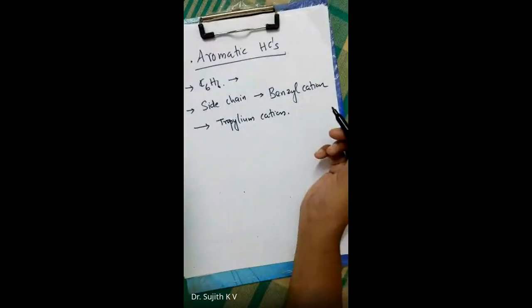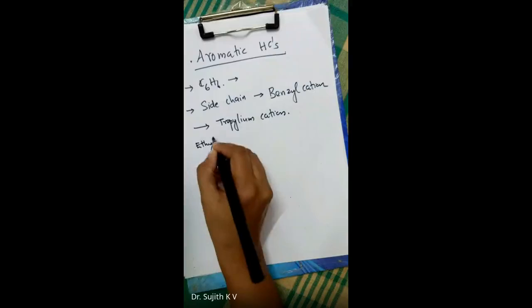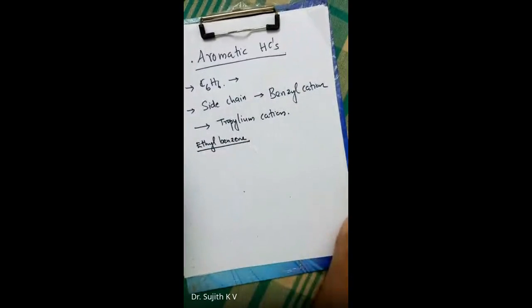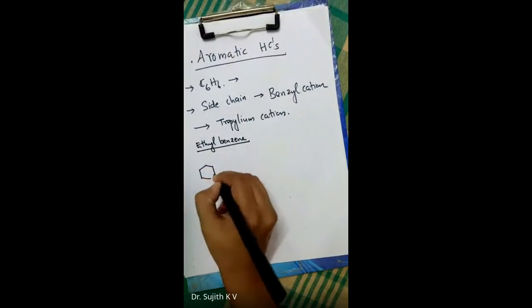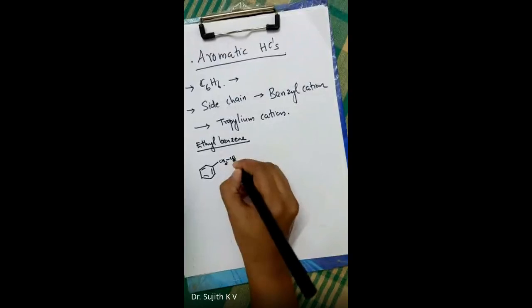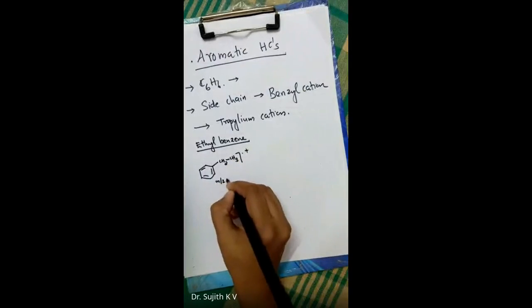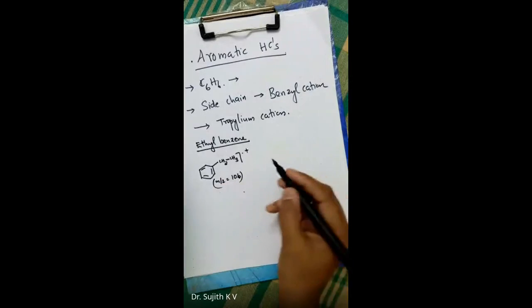Okay, this is the normal fragmentation pattern when it comes to the substituted benzenes. So let's check with the example of ethyl benzene. Ethyl benzene is this one, C6H5CH2CH3 radical cation. The m/z value is at 106. That is the molecular weight of this ethyl benzene.